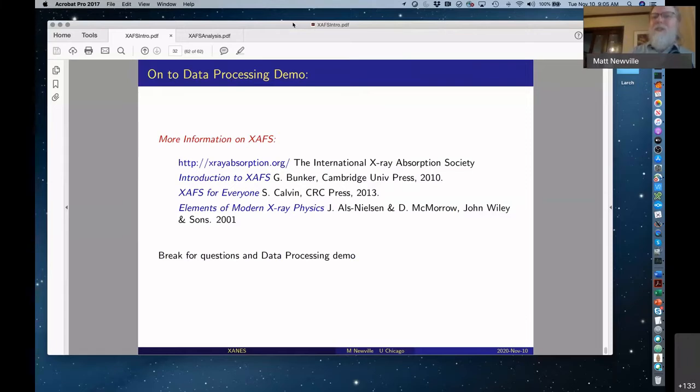10 ppm, it's challenging. And for the biological and catalysis communities, those are probably a little bit lower than that, because I'm mostly working with people who bring rock samples, and they're interested in copper, but the calcium is enormous. So the backgrounds are higher in rocks, or arsenic in iron oxide, right? So it's doable at the 10s to 100s of ppm.